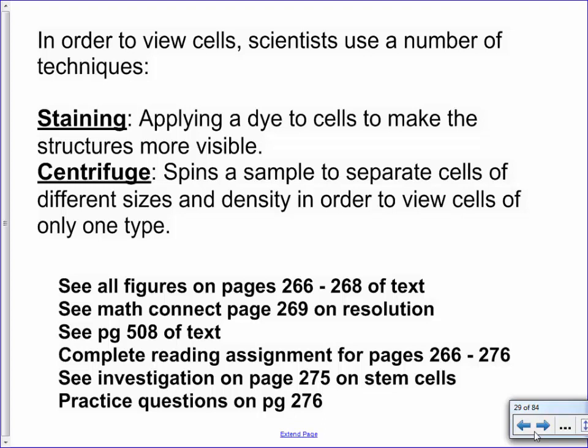The spinning around in a circle device? It's got like two things and you put it in there. Yeah, and it whips it around. I imagine kind of like one of those things they use to test astronauts before they go into space, where they work them around in circles to make sure they don't black out. Yeah, like a G-force thing, right? Only it's not massive, it's just a small thing. So, I have used a centrifuge before myself in university.